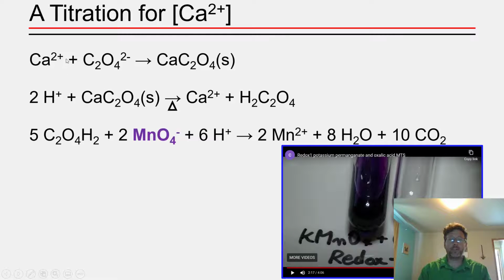The calcium in the original urine sample is precipitated through a slow precipitation with oxalate to form calcium oxalate solid, CaC2O4. This calcium oxalate solid is dried, isolated, and then digested in heated acid to redissolve the calcium and to make 1 mole of oxalic acid, the conjugate acid of oxalate, for every mole of calcium that was in the precipitate.